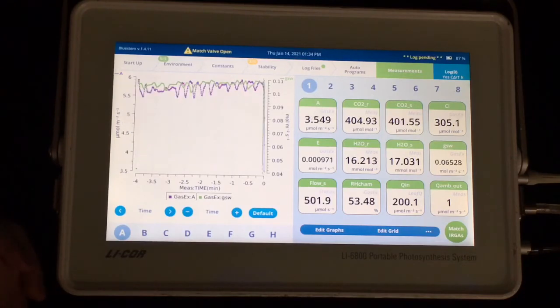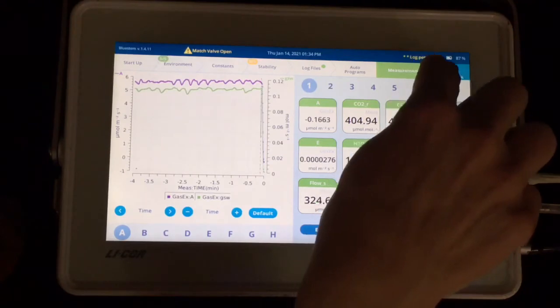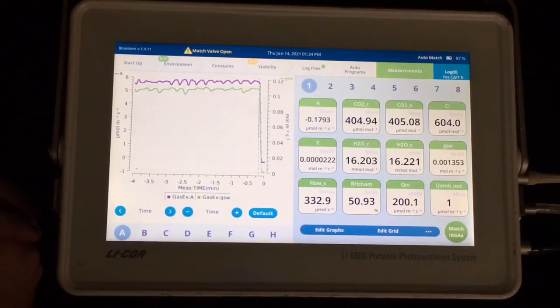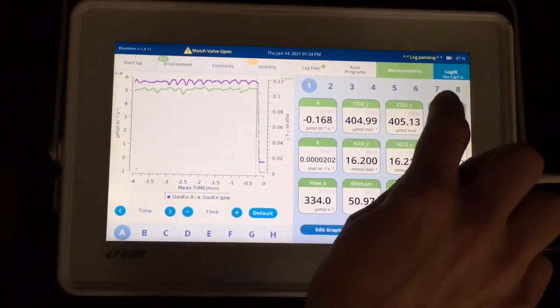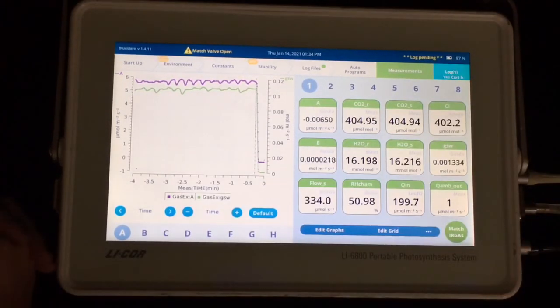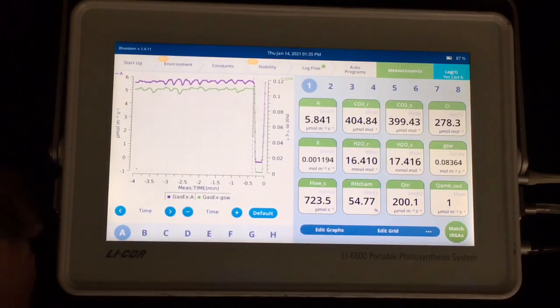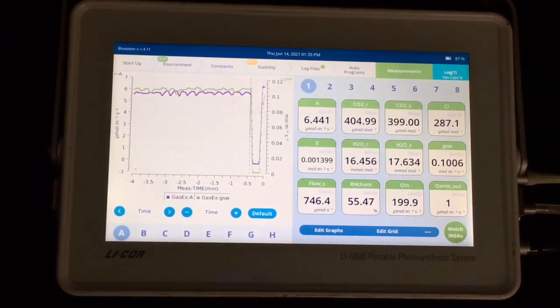And I would just press my log button. And it's going to go ahead and give that flash and log the data point. And in this case because of that match requirement it's going to go ahead and automatically match my analyzers. And then once that's done. That will increment the number of data points to one. And it will go back to sort of normal mode. And this is where I can unclamp and move to my next leaf.